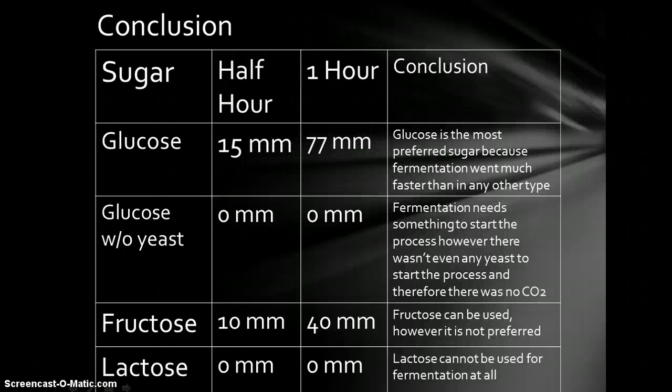Fructose is another sugar that can be used, however, it is not necessarily preferred because, as you can see, glucose was a lot more effective. And lactose cannot be used for fermentation whatsoever.